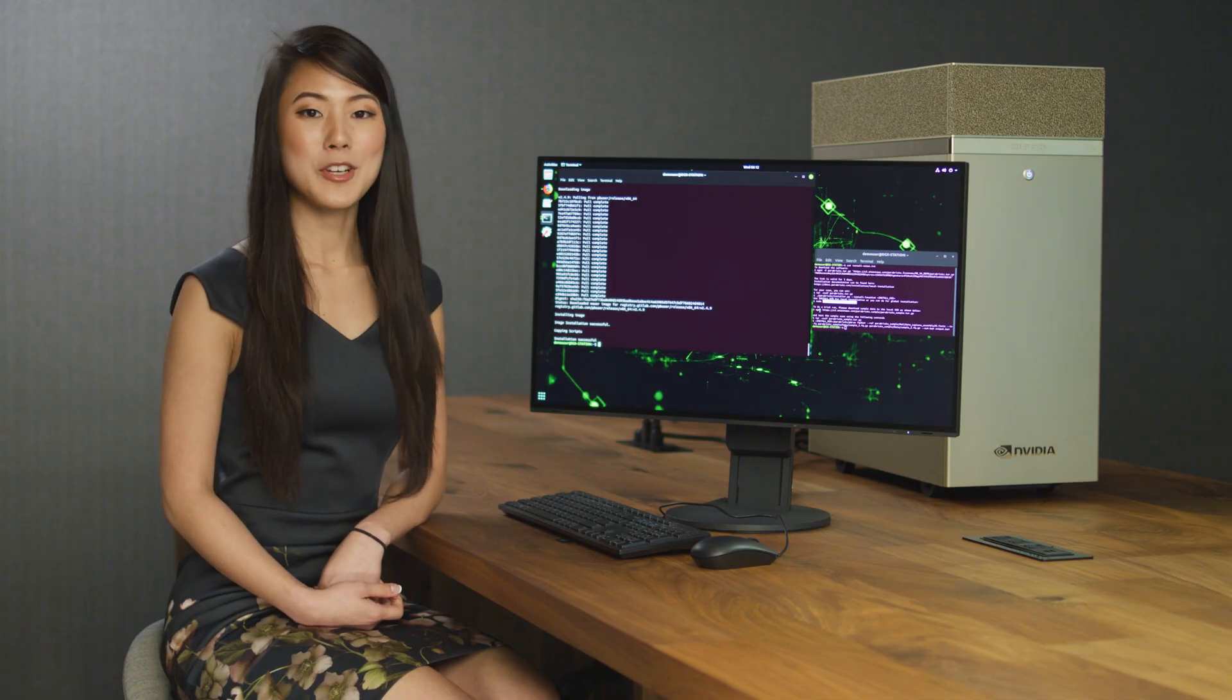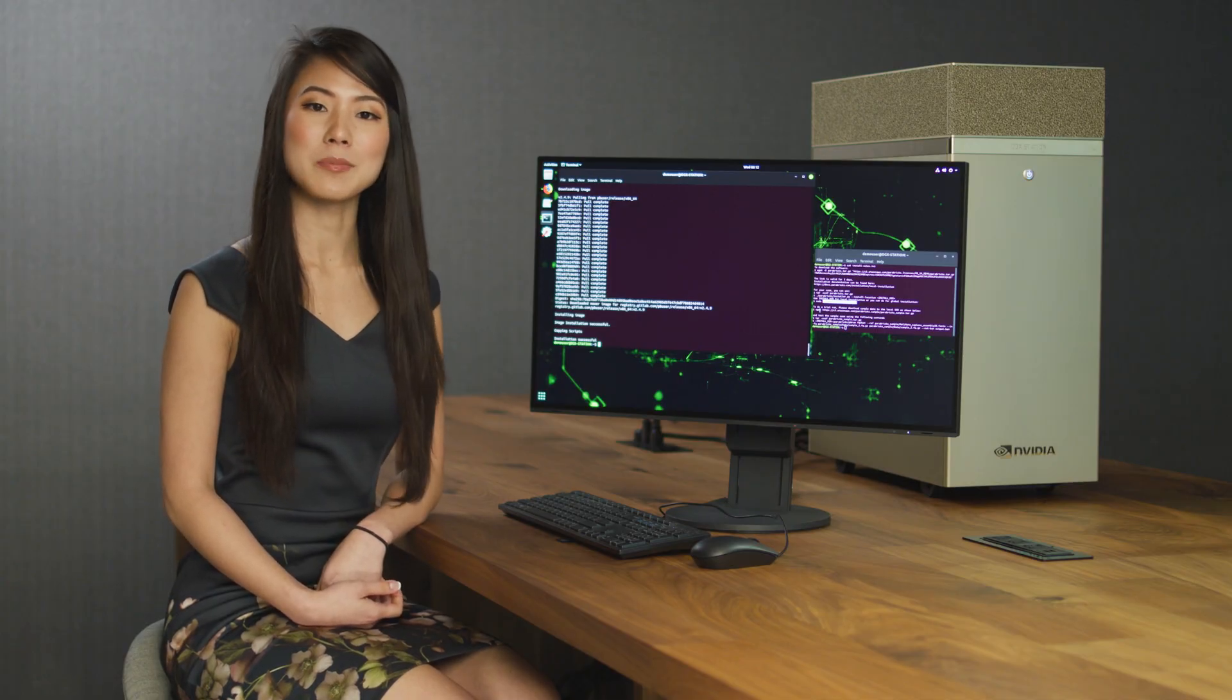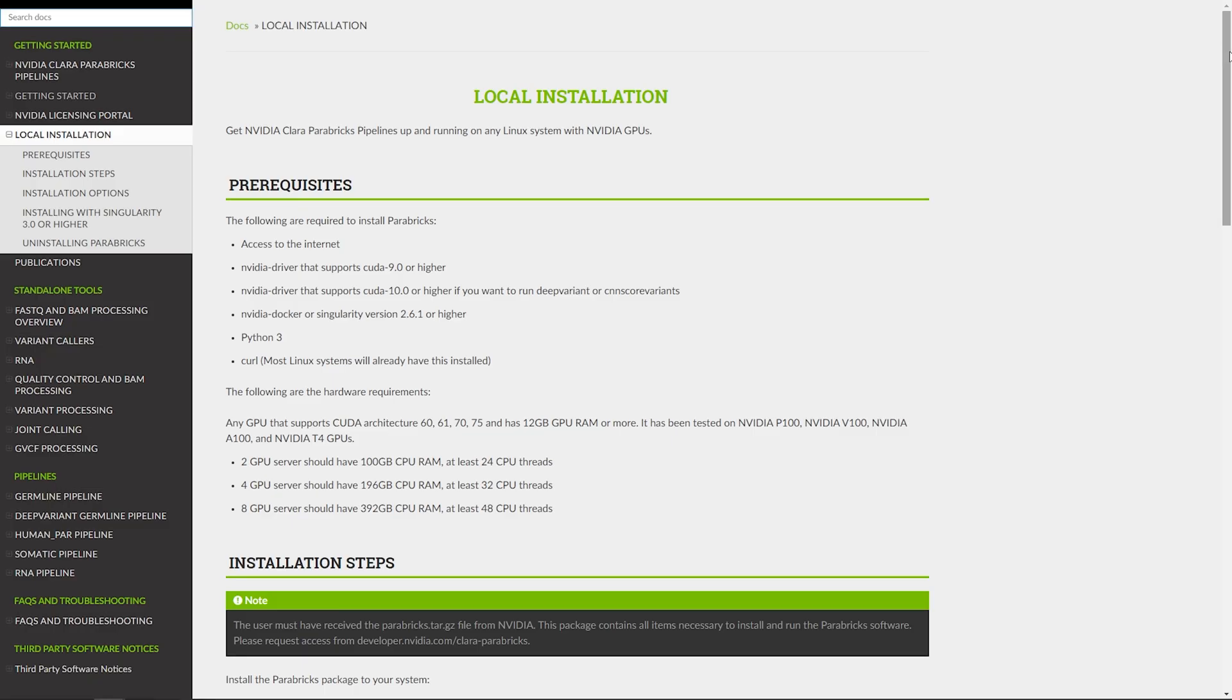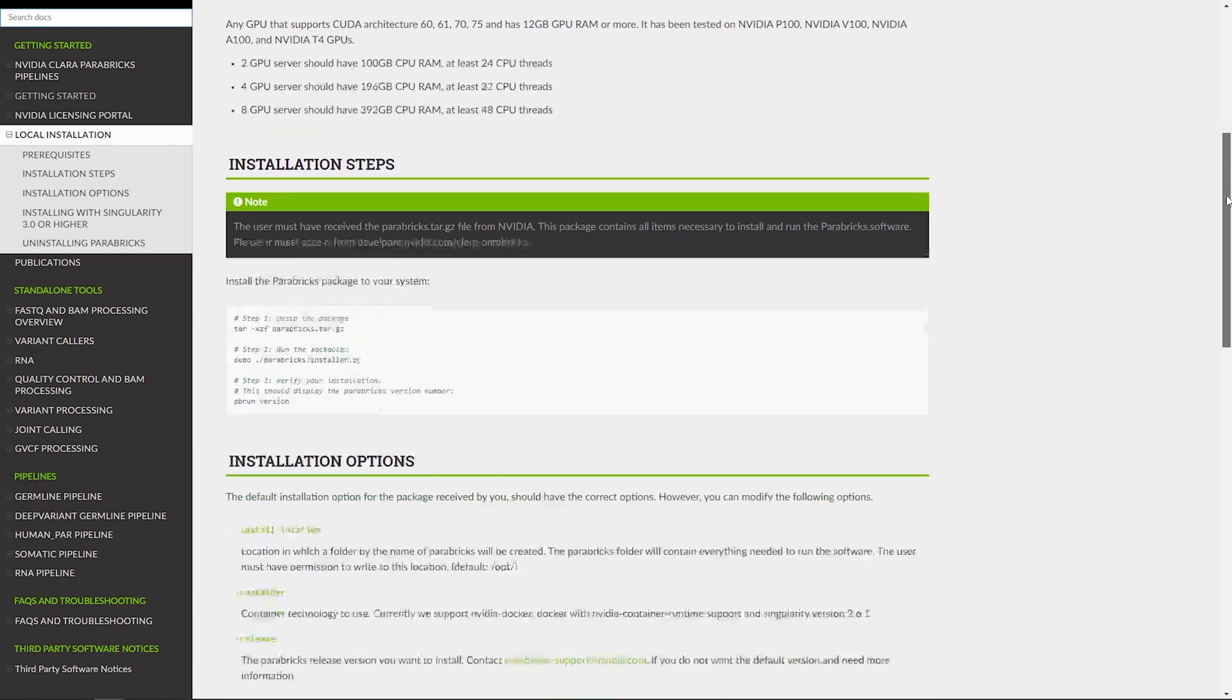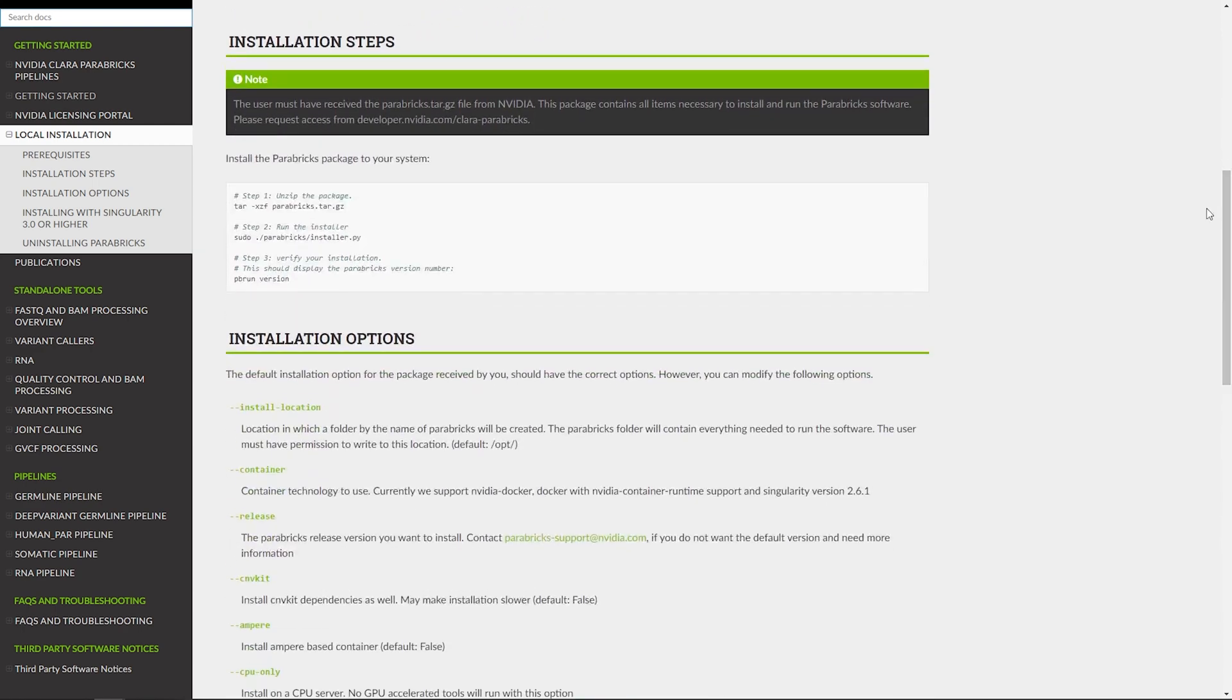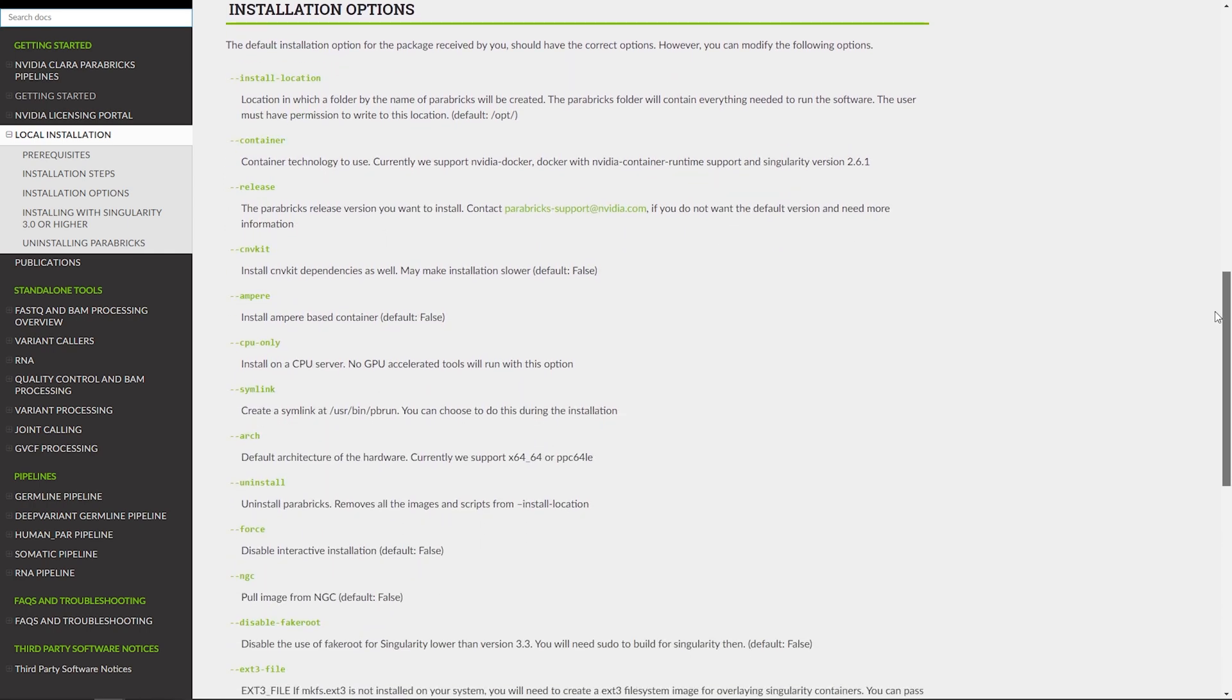And that's it. You're now ready to run Parabricks on your system. Additional installation instructions such as local installation, release number, and uninstall options can be found on local installation tab.